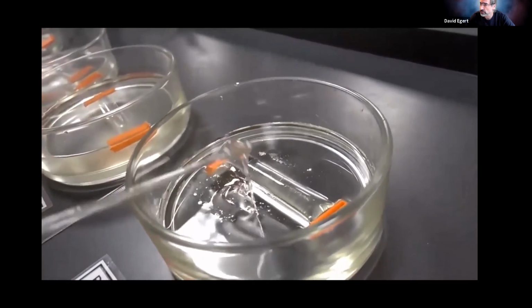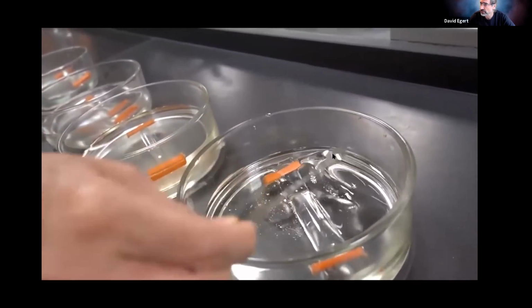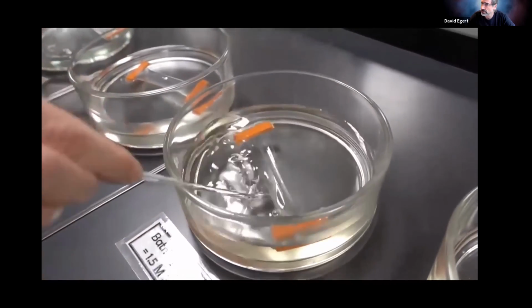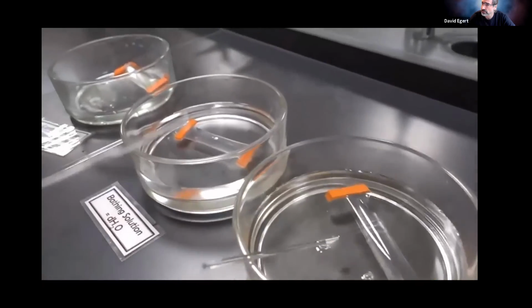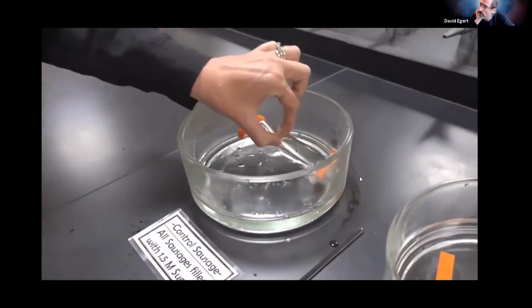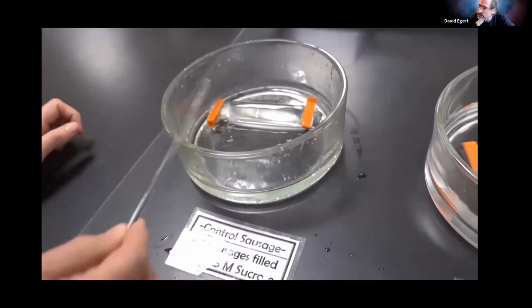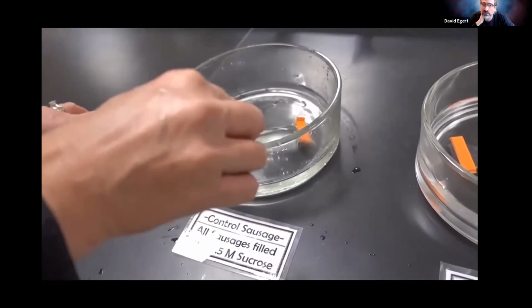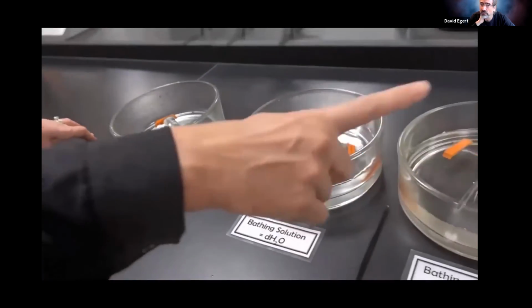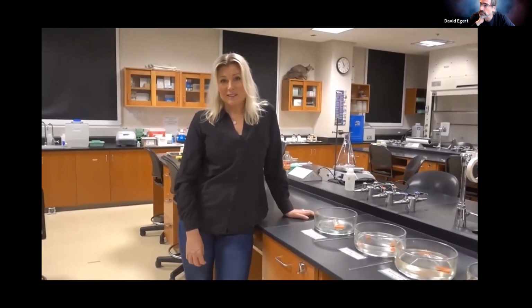If I stir it, you can see it's quite concentrated and sticky and thick, versus here, it still has sugar in it, but it's a lot more dilute. And then distilled water, of course, is just distilled water. I'm also going to leave this control sausage here, because when I come back in 30 minutes, I can tap on this and feel what the original consistency of this sausage was, and then compare what has happened to the other 3 sausages. So we'll come back in 30 minutes and take a look at that.